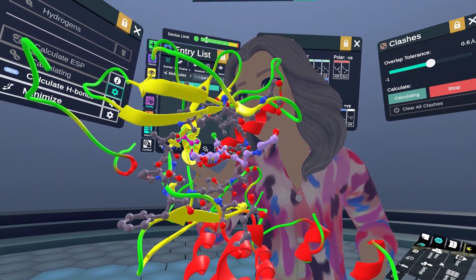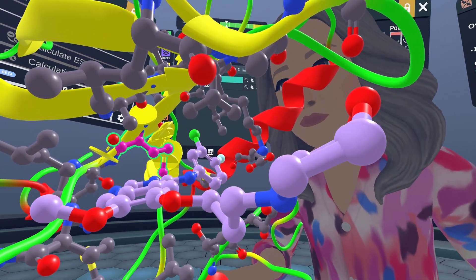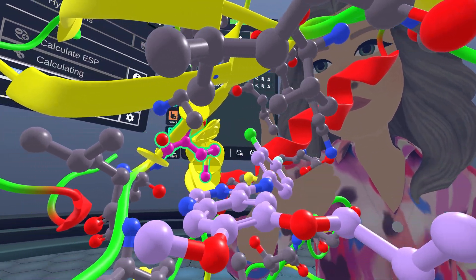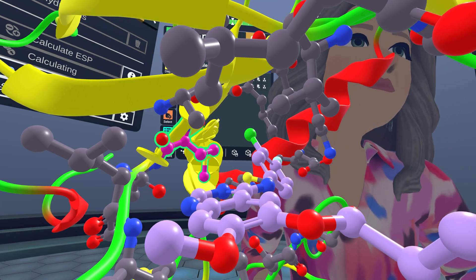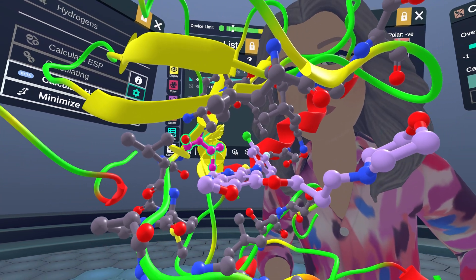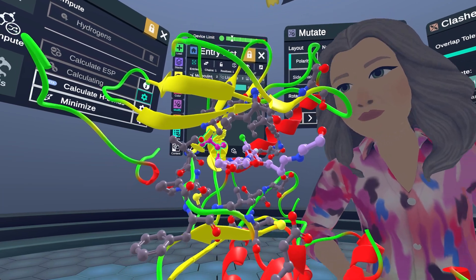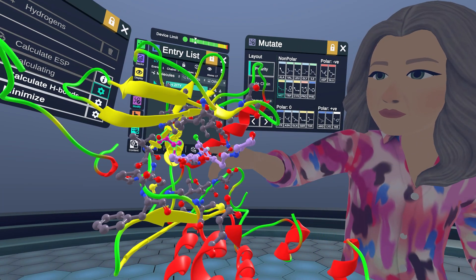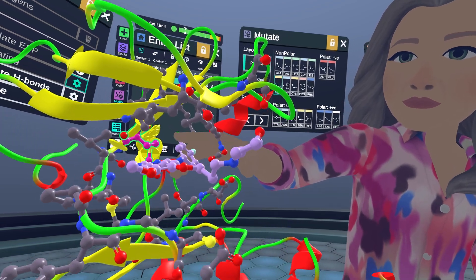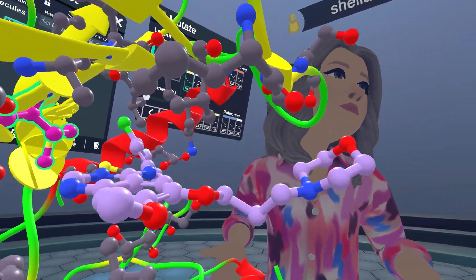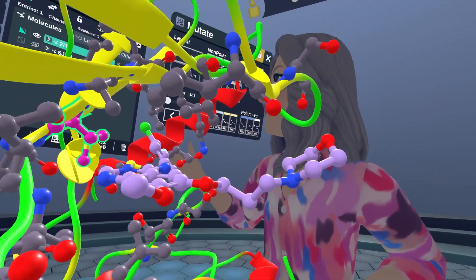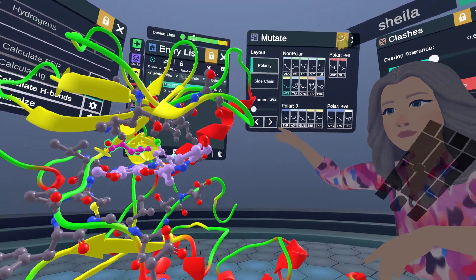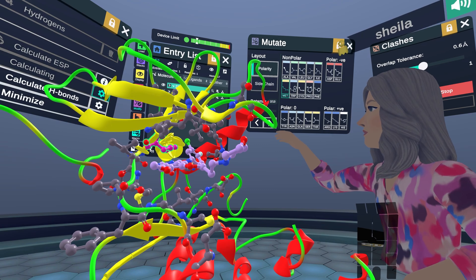For this very first rotamer, we can see there are a lot of clashes with the protein. This would not be a good model for why this methionine leads to resistance to gefitinib — it's not even interacting with the gefitinib, there's no clash there. The hypothesis is that if we found clashes with the gefitinib, maybe that would explain why it loses potency.